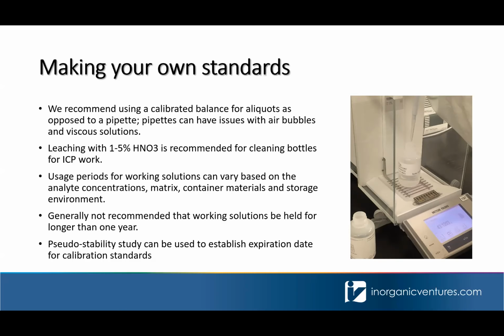You can do what I call a pseudo stability study to be able to establish an expiration date of your calibration standards. So what you would do here is take an aged solution and compare that head to head against a freshly made solution. So you don't have to use a calibration, you're just using raw data to compare the material.